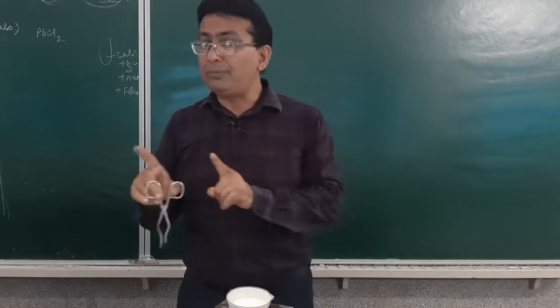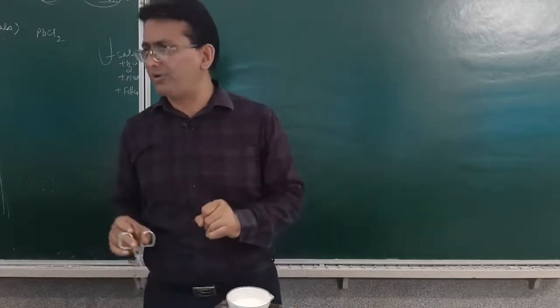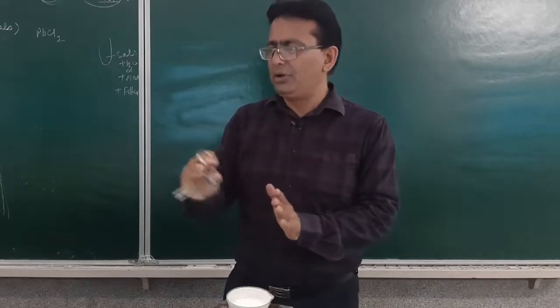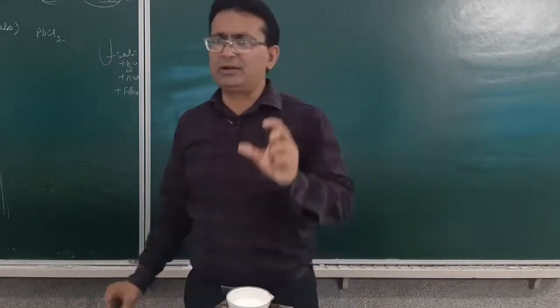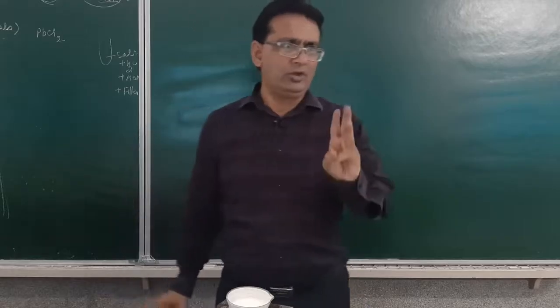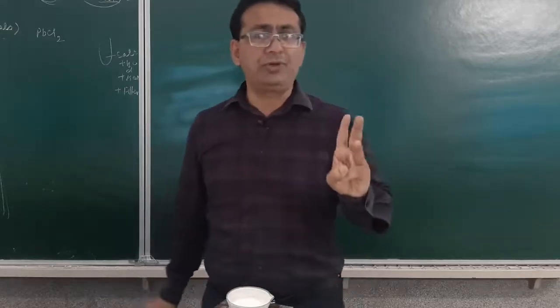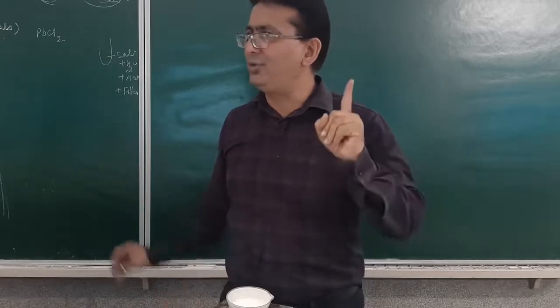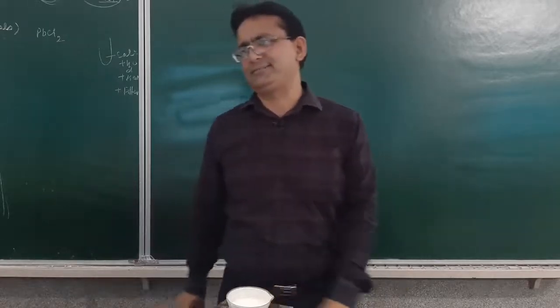But while you are doing the practical, you don't have so much time. So what you will be doing, in the meantime while it is getting heated up, is carrying out the other tests so that the time is not wasted in the examination. You have 3 hours. In 3 hours you have to do a titration, the organic analysis, the mixture, and this salt analysis.